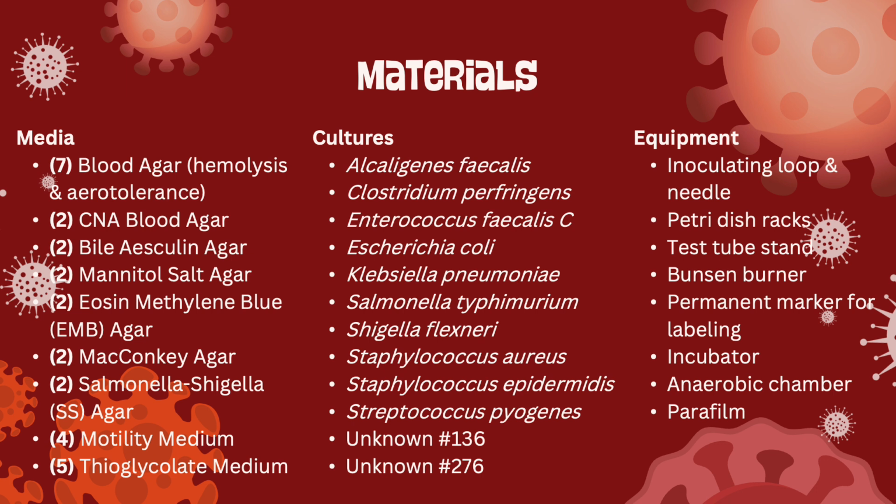Now for our materials. For media, we used blood agar, CNA blood agar, bile esculin agar, mannitol salt agar, eosin methylene blue agar, MacConkey agar, Salmonella Shigella agar, motility medium, and thioglycolate medium.